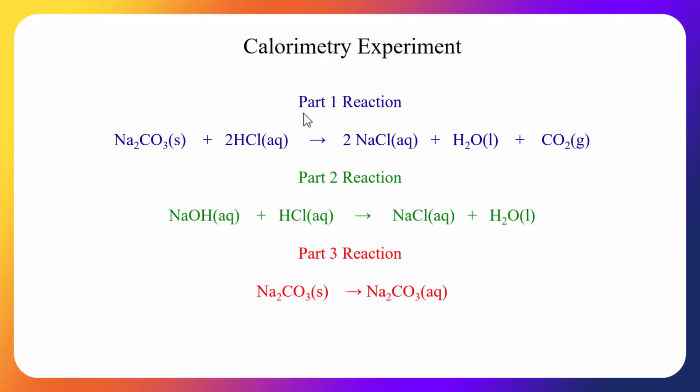Now we did the first part. Now we're going to do the second part here. That's sodium hydroxide plus HCl giving me sodium chloride plus water.